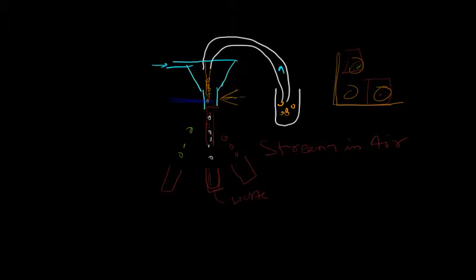This is what I'm seeing in the textbook. So how does it deflect? How does it do this? Let's look at the process now. This is a general anatomy. There are voltage plates, and this is how it happens. Let's dive deep into this component. I start from the flow cell.